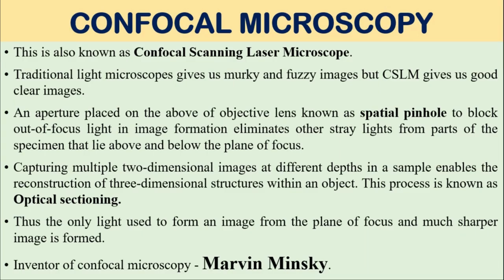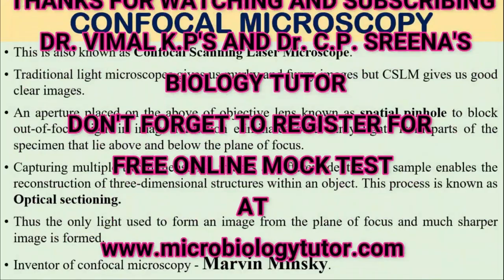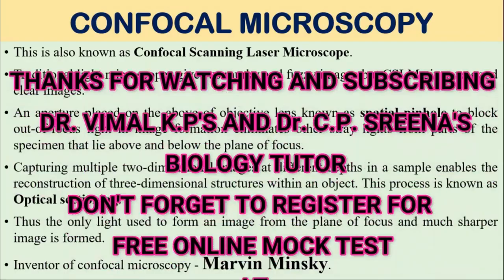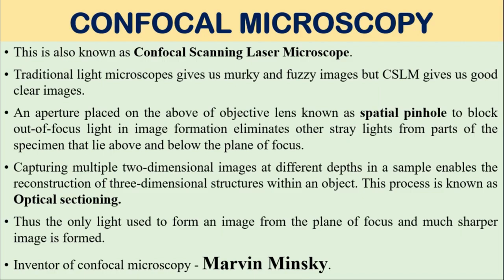Here an aperture is placed above the objective lens. It is known as the spatial pinhole. You should remember that particular point, spatial pinhole, to block out of focus light. What is the purpose of spatial pinhole? To block out of focus light in the image and eliminate other stray light from parts of the specimen that lie above and below the plane of focus.